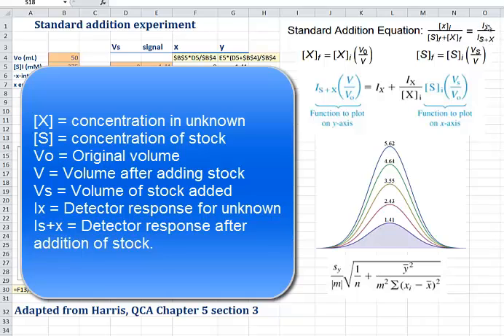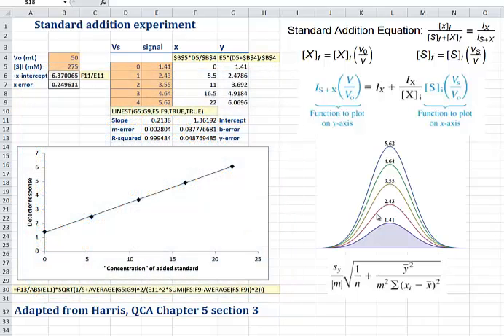IX is the intensity of the signal response or detector response of our unknown, and IS+X is the intensity after we've added some stock solution. I've got a trivial example here. Let's say this results from an HPLC chromatogram. We start off with our unknown, which is the shaded region, and let's say that has a response of 1.41 detector units. Each subsequent one represents additions of our stock solution, and the numbers here are the height of the peak after those additions.